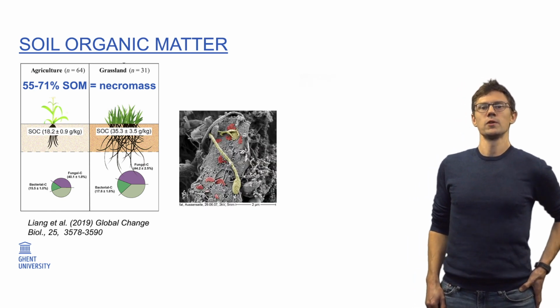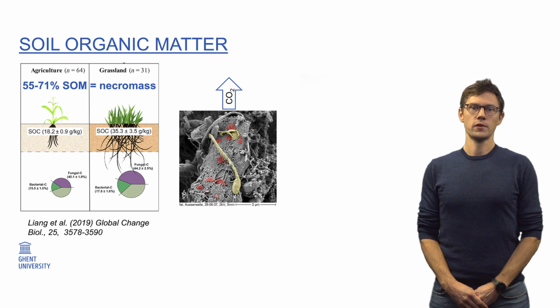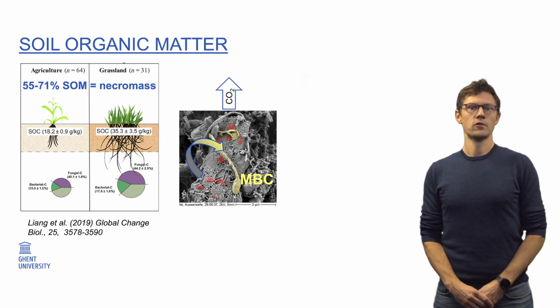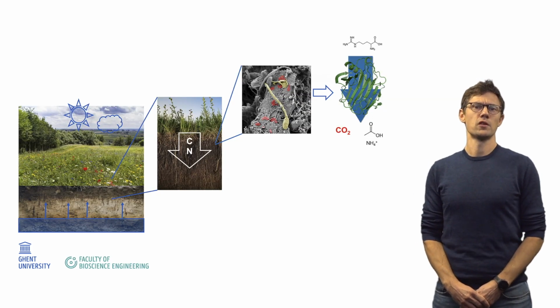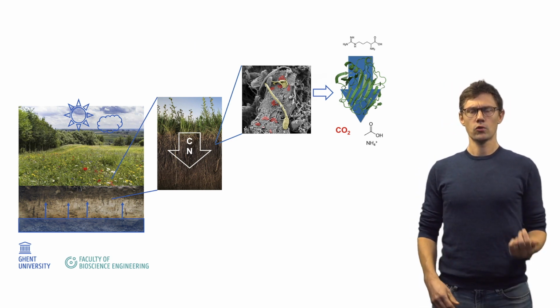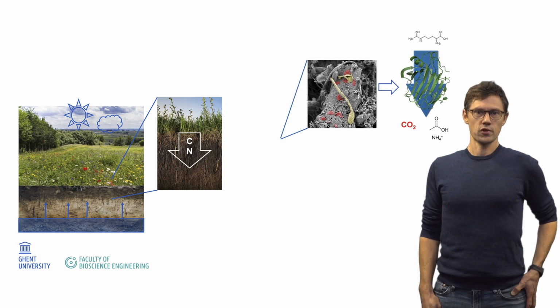So to understand the stability of organic matter, we need to understand what leads microbes to either respire or, on the contrary, form biomass, the precursor of much of soil organic matter. For this, we would also like to map the habitat space of microbes, the pore space. Even though soil pore space is notoriously difficult to grasp because it cannot be sampled or seen, we do realize that it would be relevant to understand soil microbial processes.